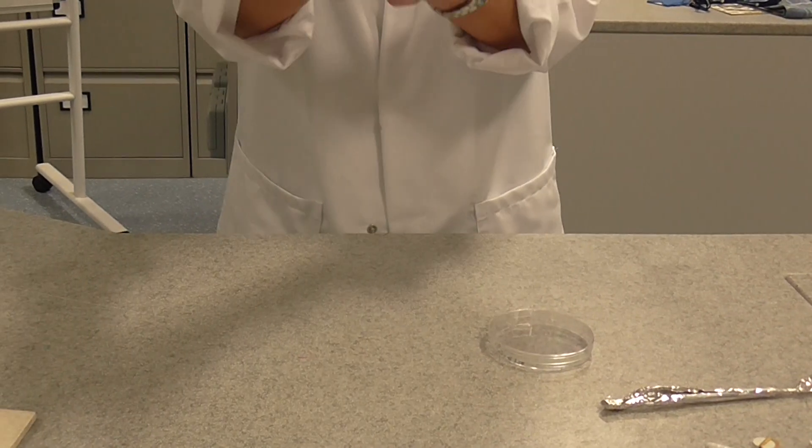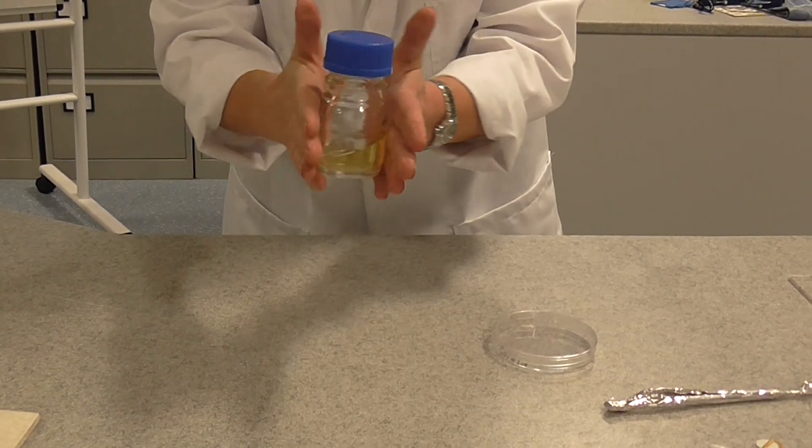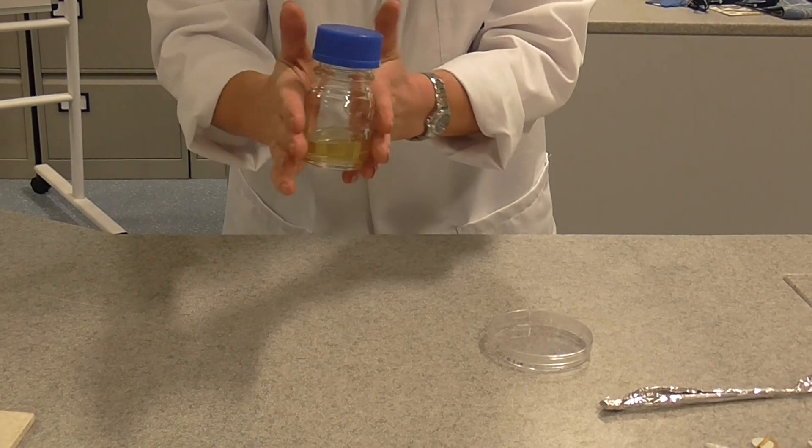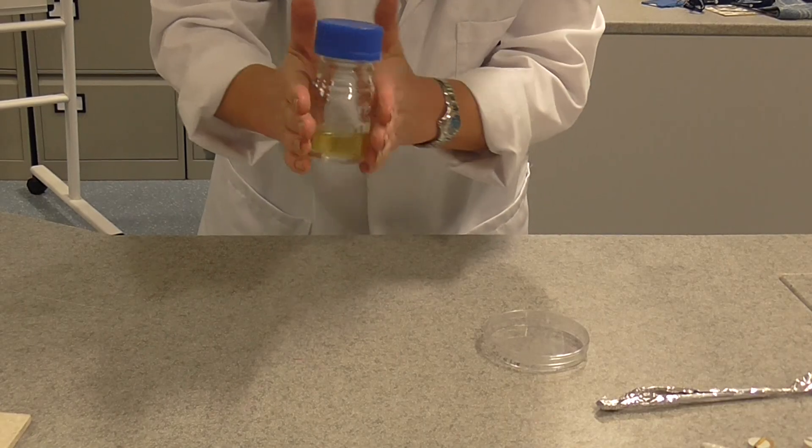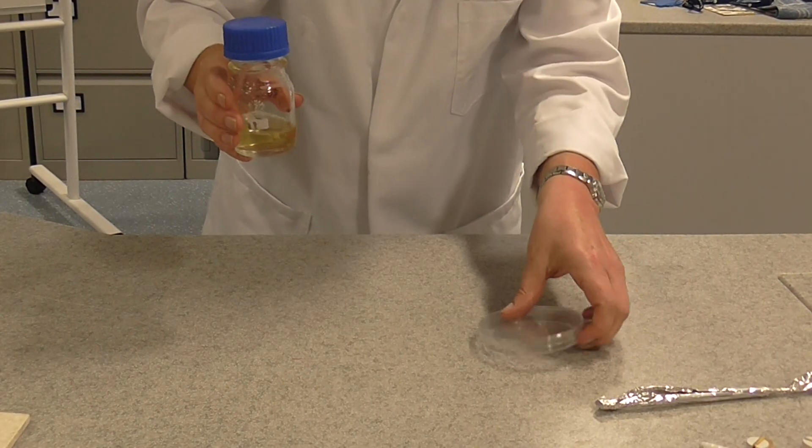We need to now make sure the bacteria is carefully mixed in with the agar. You don't want to shake it because it will form lots of bubbles, become a bit frothy. So we're just going to gently roll it.